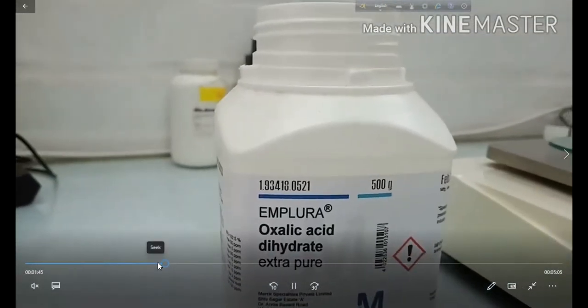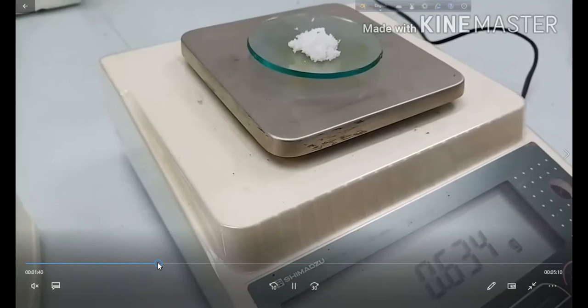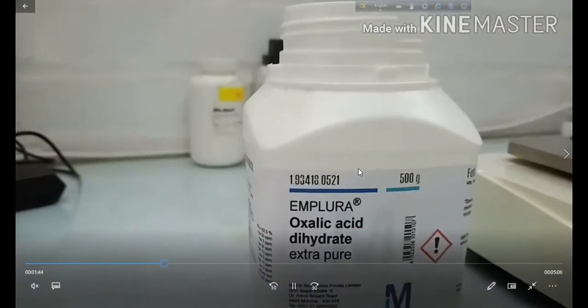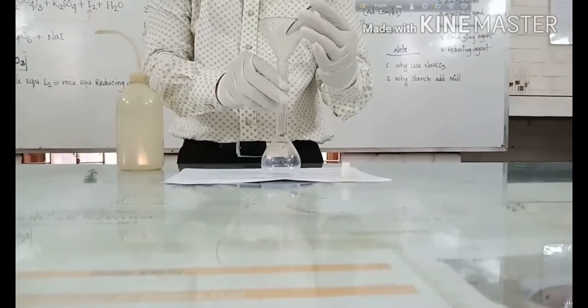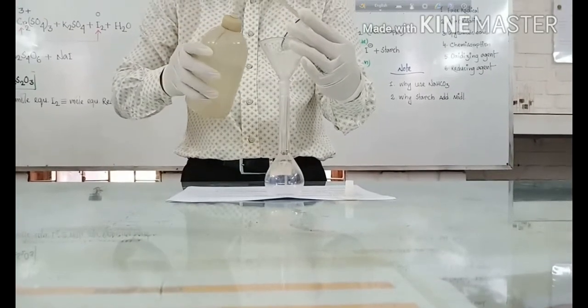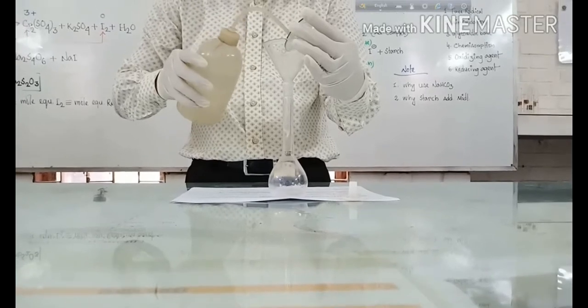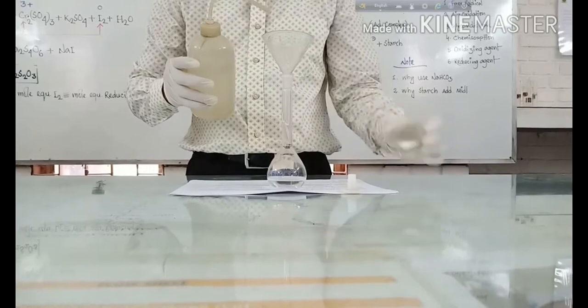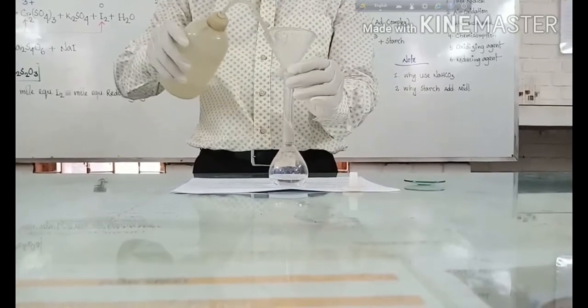you can see that here the oxalic acid dihydrate solution amount is 0.634, actually 4 for the exact calculation, because the molecular weight of oxalic acid is 126.07, maybe that's why it's 0.634. So you will just calculate this way, whatever the molecular weight.